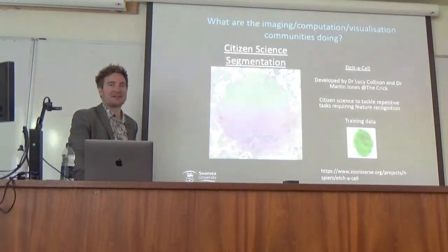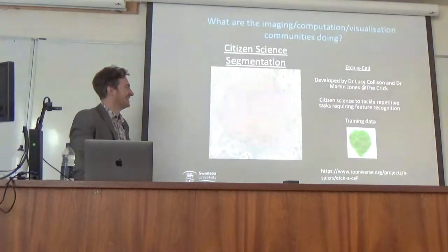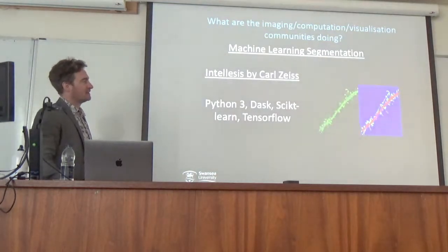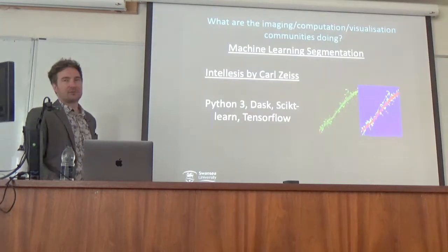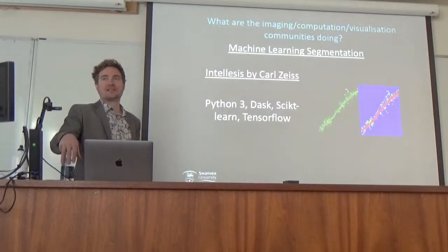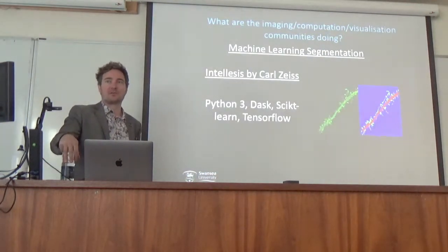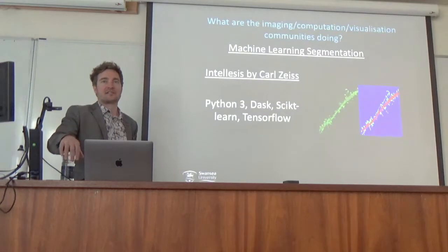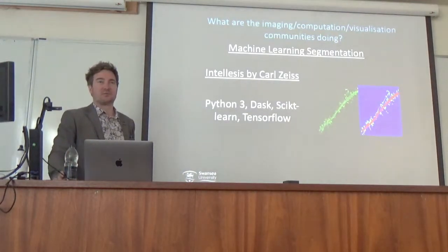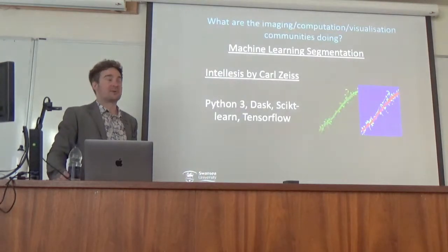sets. That's the dream. The one we're looking at isn't open, it is paid-for software, but we partner with Zeiss, and so we're trying to work this into our imaging pipeline because most of our equipment is Zeiss. So you go with what is likely to work. As a user, that's what I need to do most of the time. I've got a backlog of things that need segmenting, some that are more challenging than others, and I need a tool that works and that the people in the group are happier using.